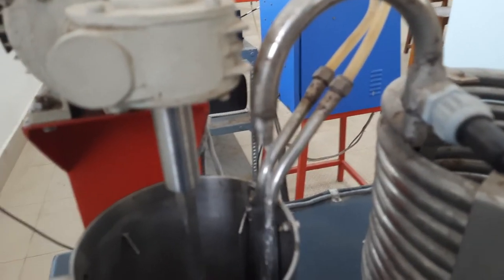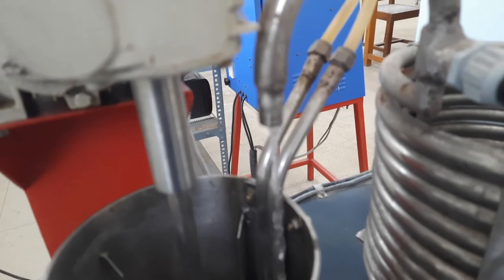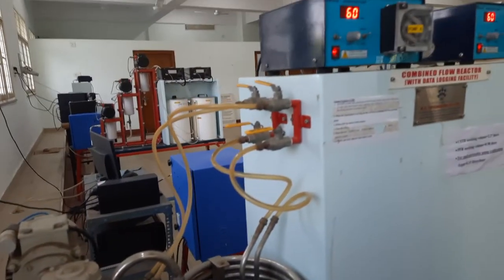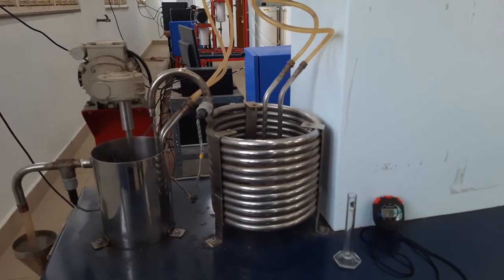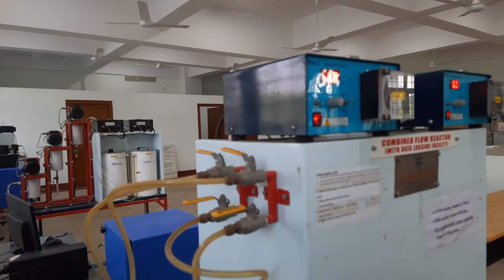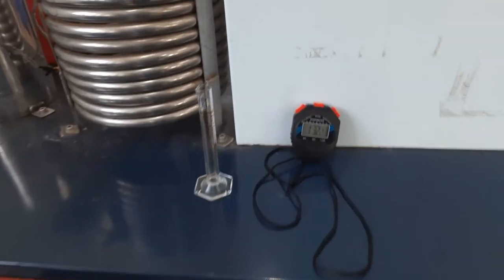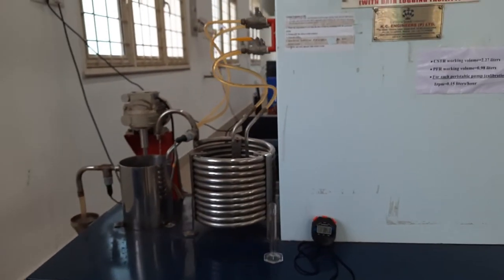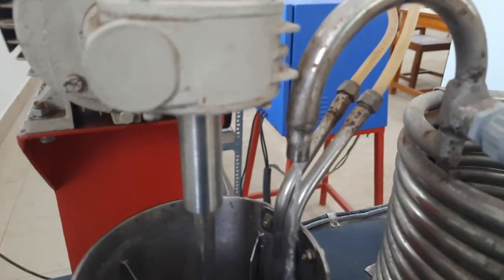You can see the product stream started coming. We'll be collecting our sample after 10 minutes. For a steady state of 5 to 10 minutes, we will start collecting the sample. You can see, since we kept a very high flow rate, we attained this within 1 minute. So we'll wait for another 10 minutes to get the steady state values. At steady state we will collect the sample.